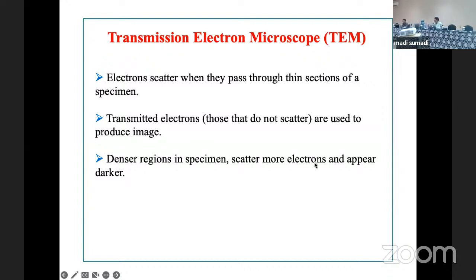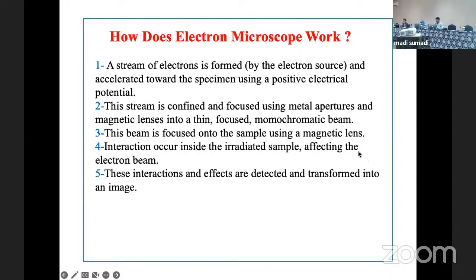You also see black and white structures. We do not get color because the electrons do not fall into the visible light range. That's why it's not possible to get a color mode. But artificially, with Photoshop, you can add colors to make a beautiful distinction between the structures.